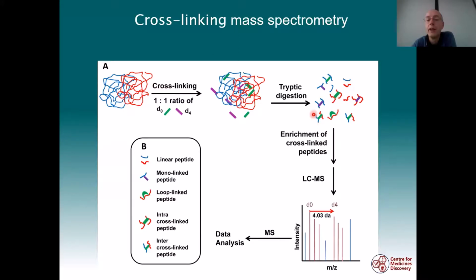Here we have our cross-linker, and we have a link between partner A and partner B. But you'll appreciate that the number of cross-linked peptides in this desirable conformation, with fragments from both binding partners, is actually quite small in relation to all of the cross-linked fragments. So we can enrich for cross-linked peptides.